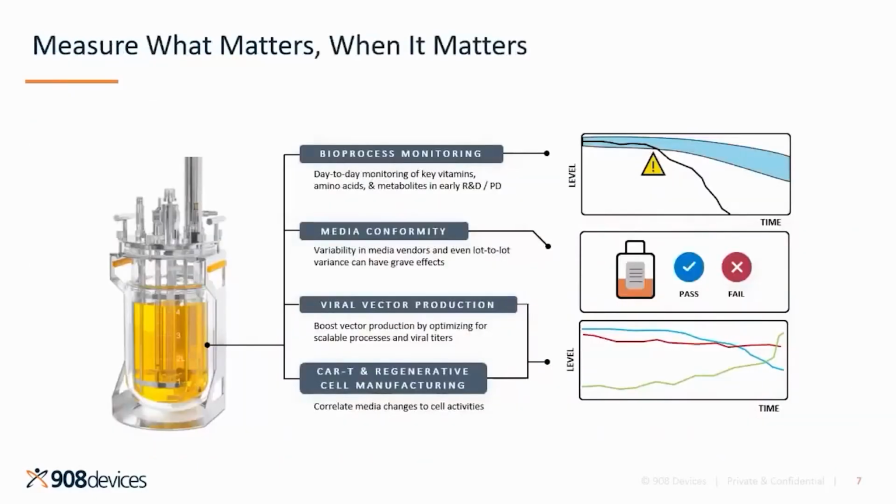During process development, you have a variety of objectives depending on the project you are working on. If you're looking to optimize the productivity or quality of a biologic, you will often take a minimum of a sample a day from your bioreactors to monitor the extracellular nutrient and metabolite levels. This data helps to inform you about the appropriate changes to a base or feed media that you should replenish or fortify if they are critically low in concentration.